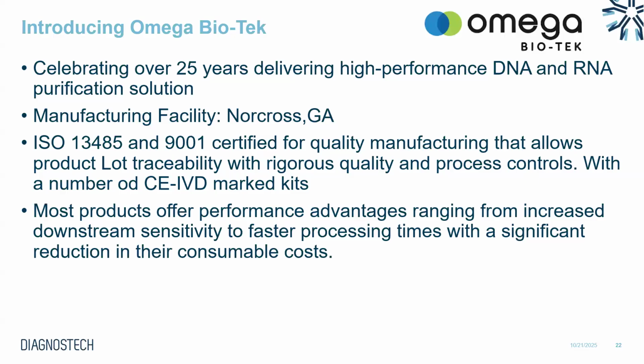So now that we've gone over very basic NGS theory, I'm going to be taking it all the way back to the beginning of the NGS workflow, which is your nucleic acid isolation. And as I'm sure you've heard with NGS, garbage in equals garbage out, meaning you need to start with high quality samples.